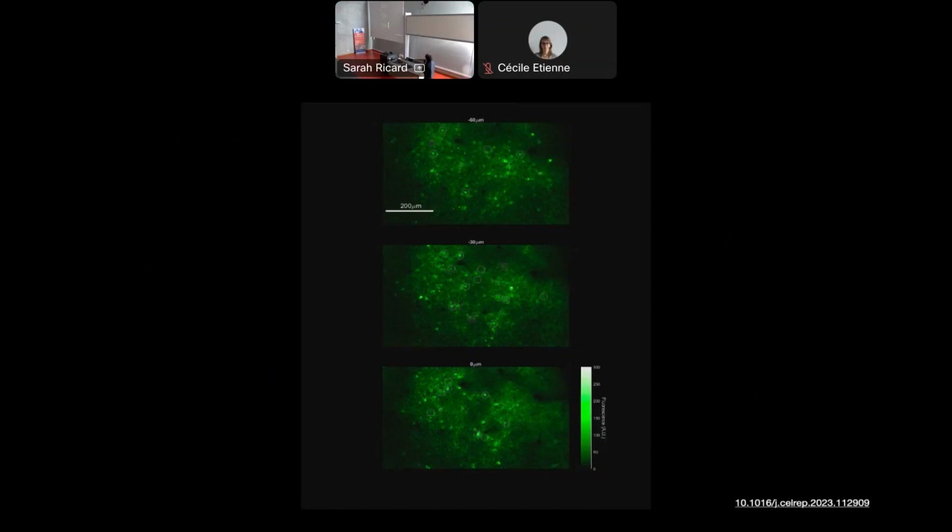So basically this is two-photon calcium imaging. There's a genetically encoded fluorescent reporter that's blinking every time the neuron is firing. And also then we're targeting neurons with our light, and every time that we target them, the fluorescence increases.